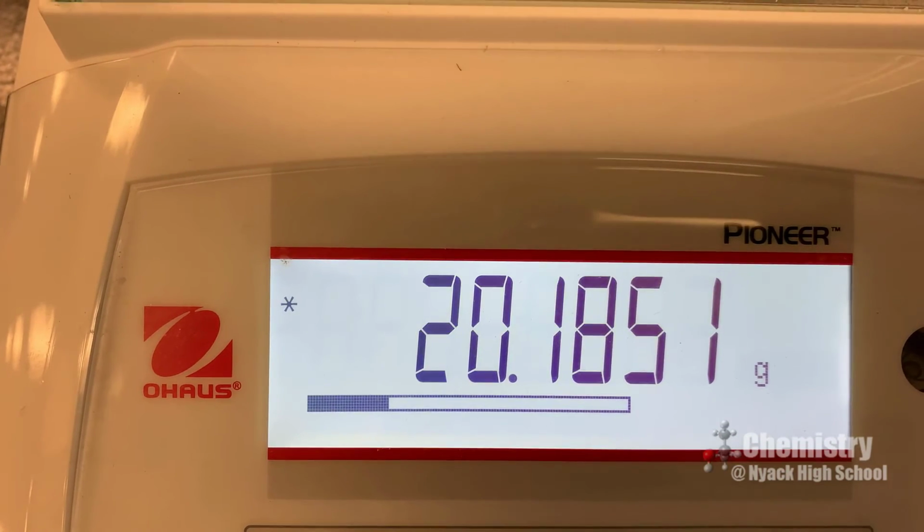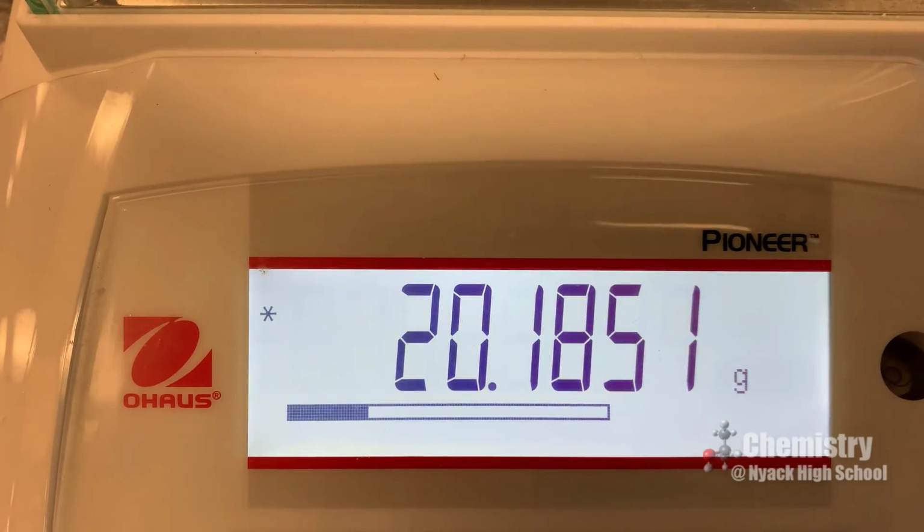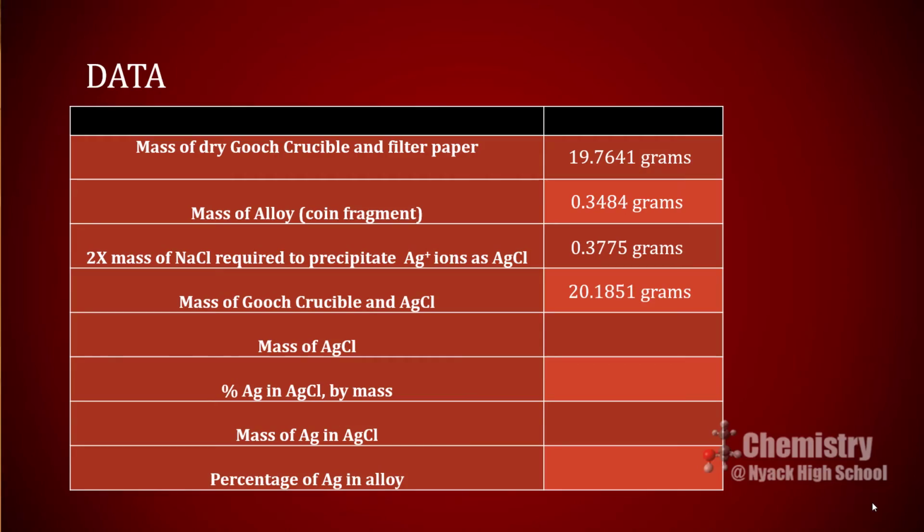And the final mass is 20.1851. At this point, you should be able to calculate the percentage of silver in the silver coin.